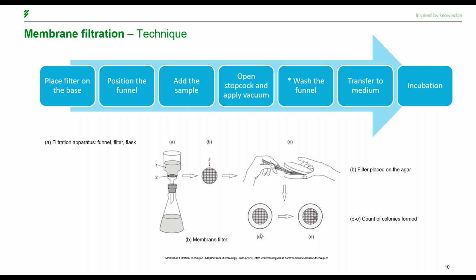Molten agar can also be used to cover the filter with the medium, and the inoculated plates are then incubated. You can use an incubator or a water bath, and of course, in the water bath the plate should be in an airtight container. The incubation conditions will depend on the microorganisms of interest.